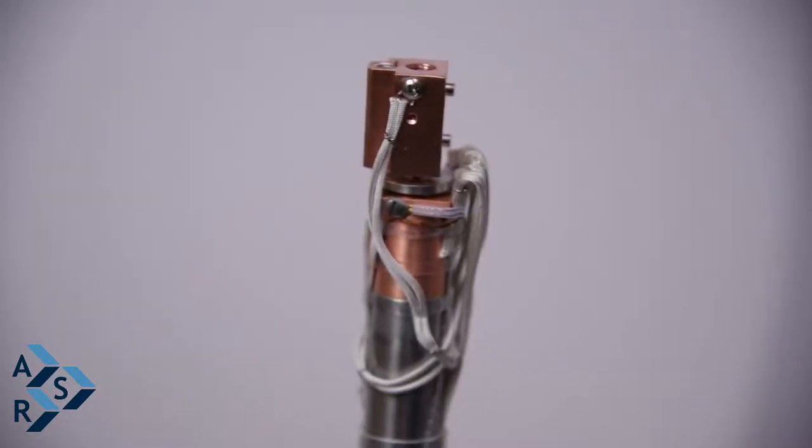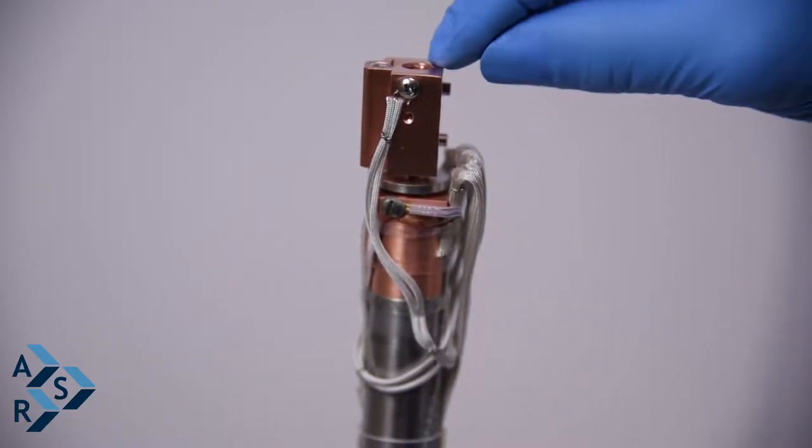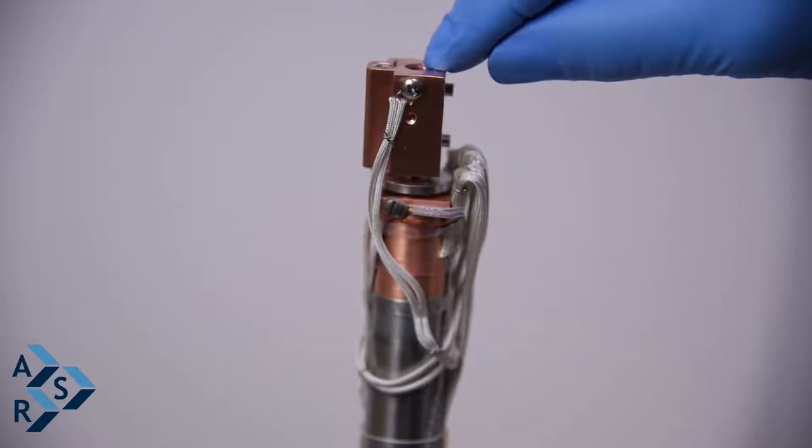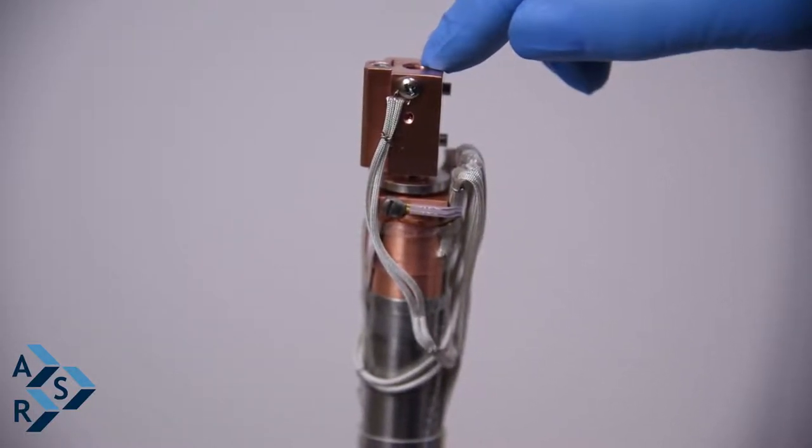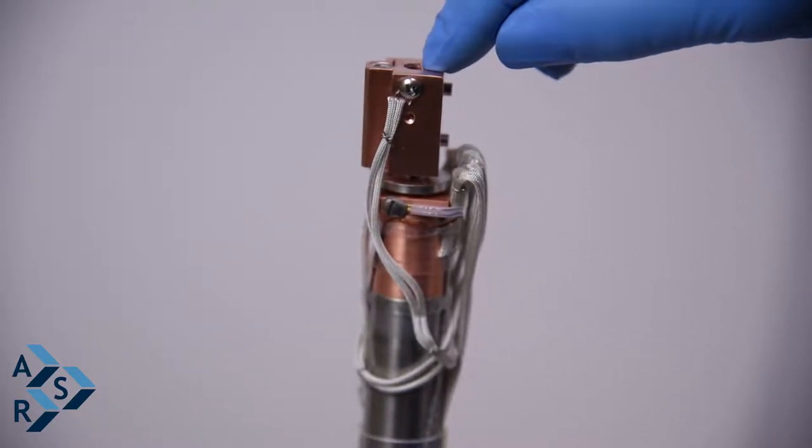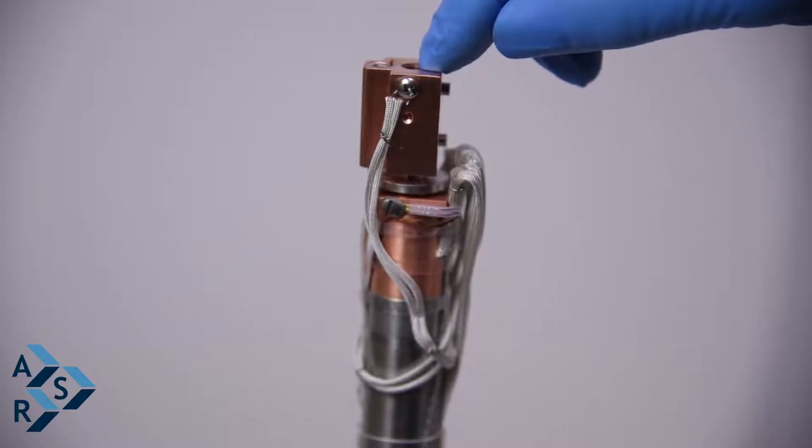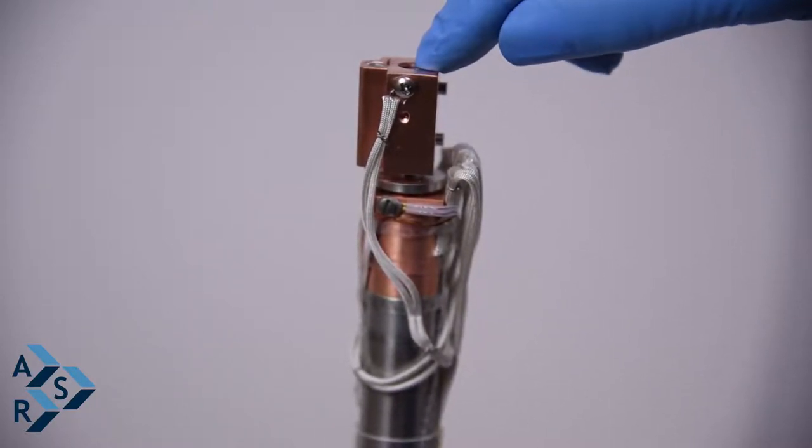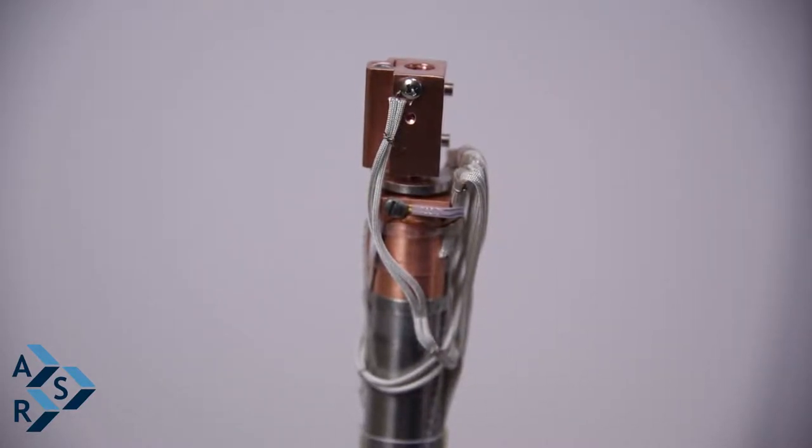The first thing you want to do is inspect your interface. There is a helicoil installed in the tip of the interface to prevent copper to copper contact with the threads, so you don't end up at high temperatures seizing the sample holder into your interface and you can have more cycle time.